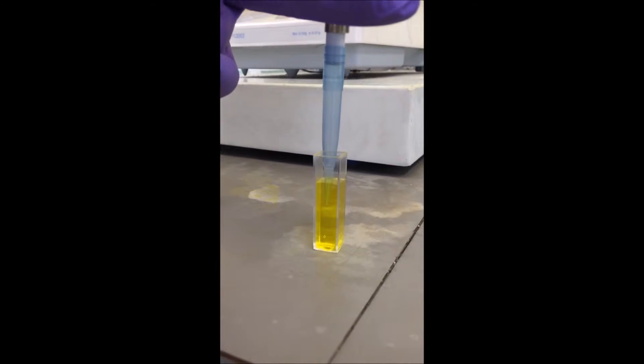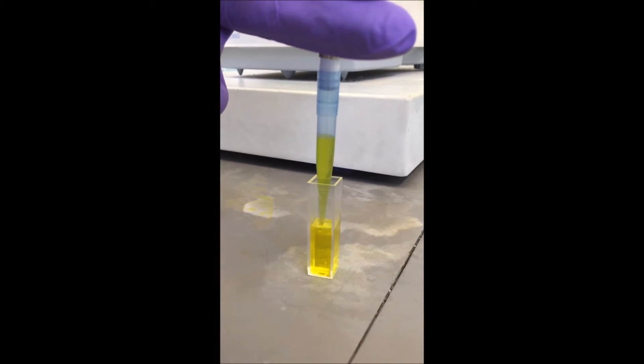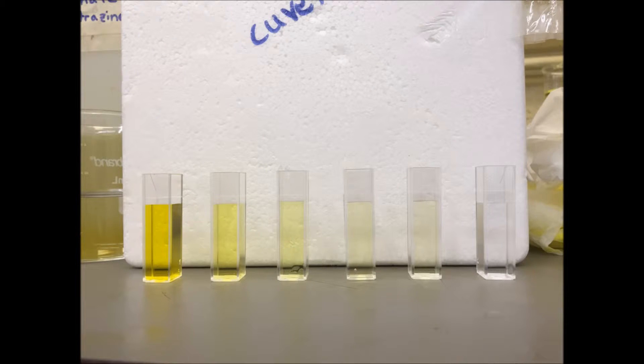Pipette out the desired amount, making sure to evenly mix like shown. Use varying concentrations of tartrazine to make your calibration curve. Your cuvettes should span from pure distilled water to more concentrated tartrazine similar to what is shown.